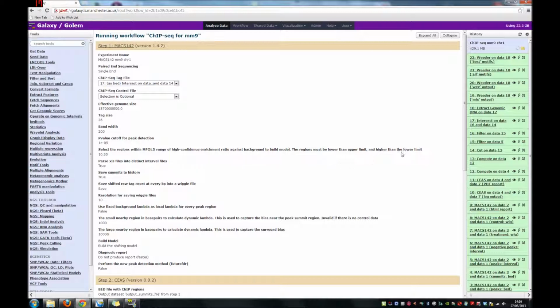So we don't want to run it in this history, because otherwise you'll get all the results of the workflow in this history. The best thing is to start a completely new history.